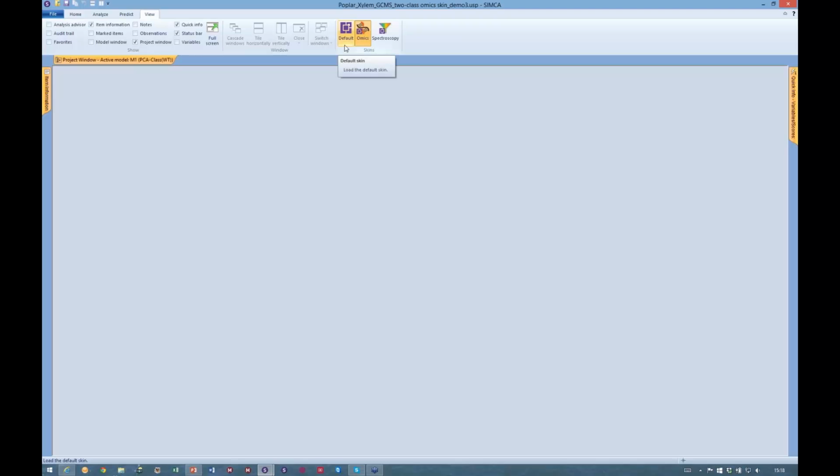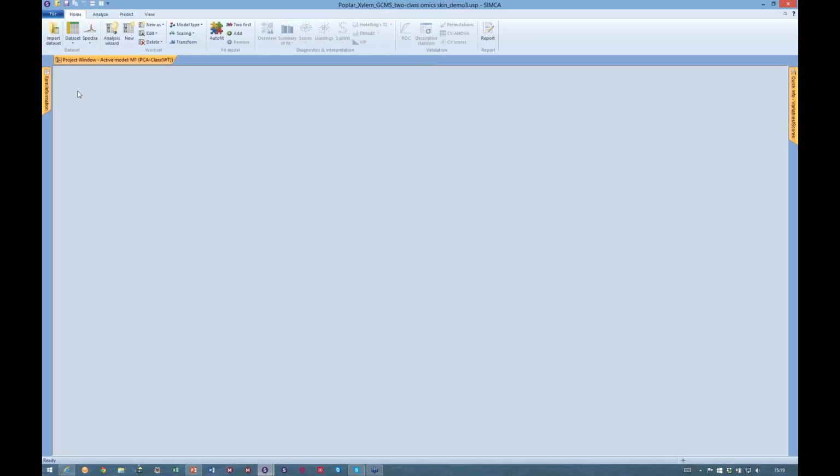We have a default skin, we have the Omics skin, and we have a spectroscopy skin. For those of you that have an interest in the spectroscopy skin, you can look up our website under the heading Recorded Webinars. There is a recorded webinar on the spectroscopic skin that was made 48 hours ago. So in this presentation we zoom in on the Omics skin.